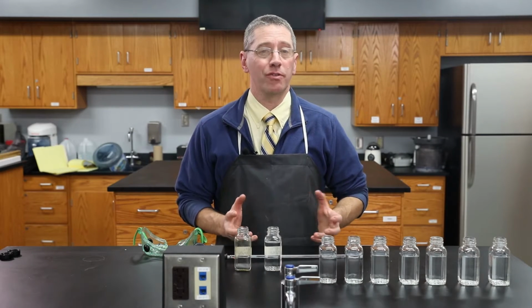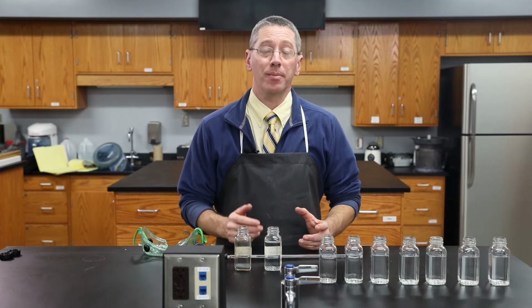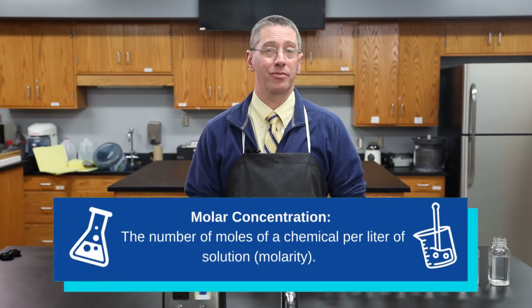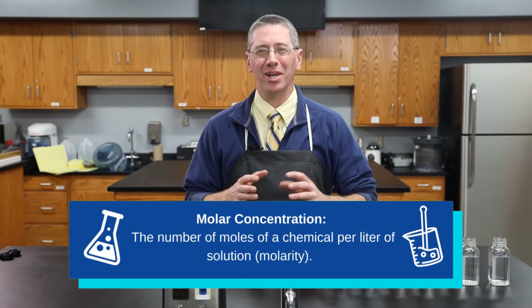So in chemistry, there are several ways to measure concentration of solutions. Most commonly, we use molarity, which is the number of moles of a chemical divided by the number of liters of solution, moles per liter. But I don't want to make a whole liter today.